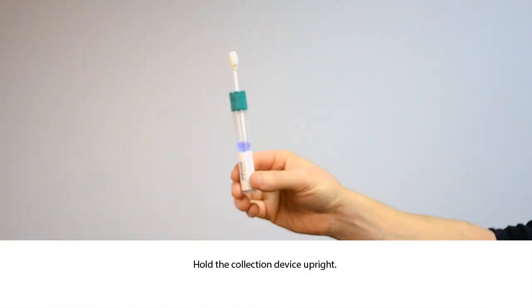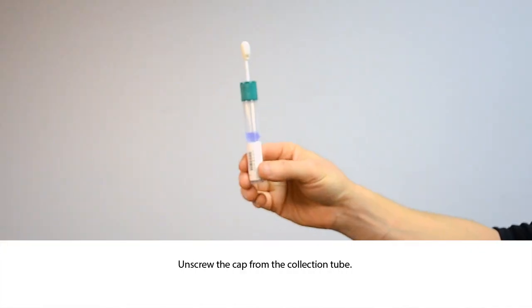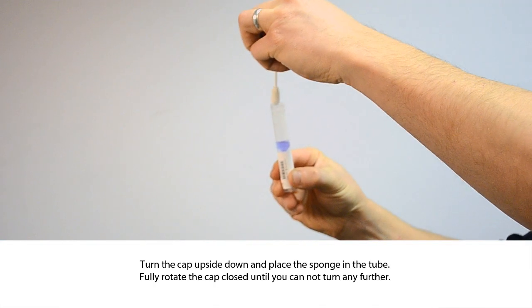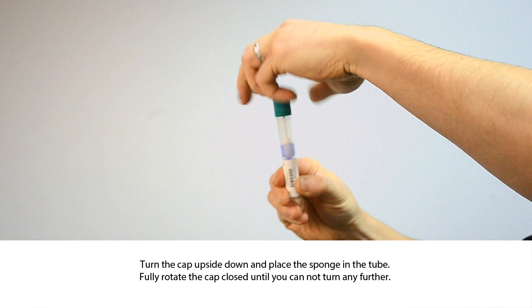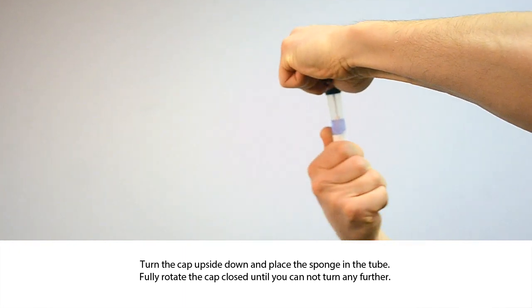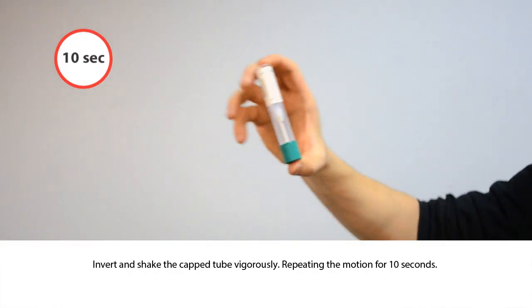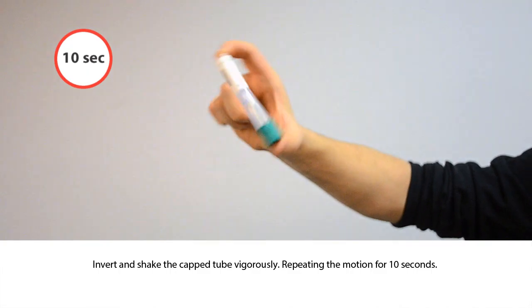Hold the collection device upright. Unscrew the cap from the collection tube. Turn the cap upside down and place the sponge into the collection tube. Fully rotate the cap closed until you cannot turn any further. Invert and shake the tube vigorously, repeating the motion for 10 seconds.